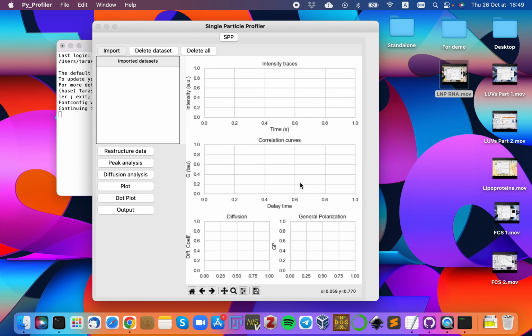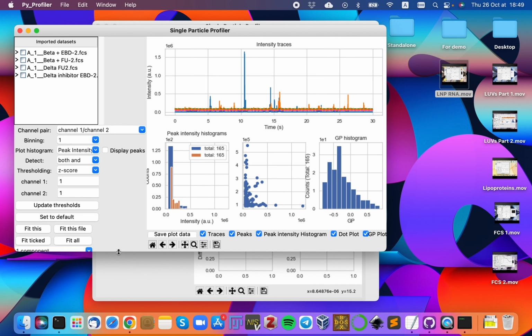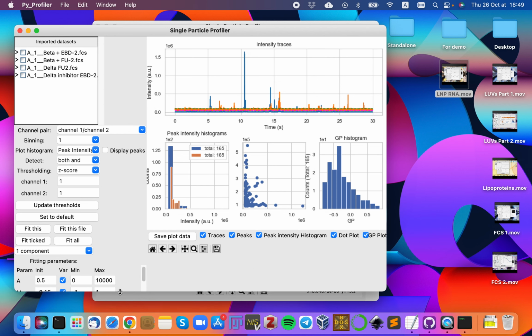So again, open. I go to the peak analysis. And here in the peak analysis, what you can do, you can again go here.